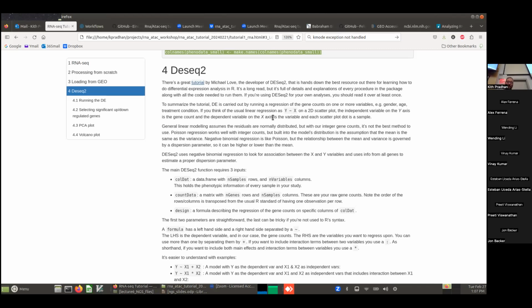Usually when you have data like this, a t-test would do if you have large samples, or if you know the data is normally distributed. In this case, we're not using normalized or Gaussian distributed data, because we're dealing with counts, actually the numbers of fragments mapping to each genomic position. So a t-test generally isn't a good choice for this sort of analysis. A test involving a Poisson distribution is another choice, because that works on counts.